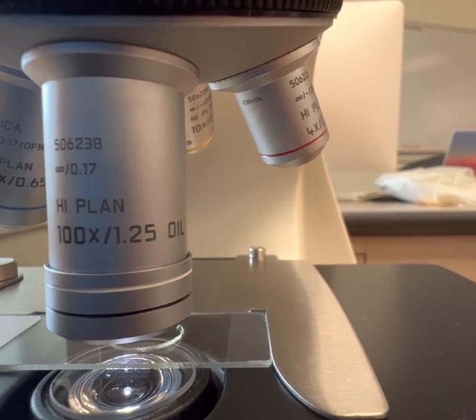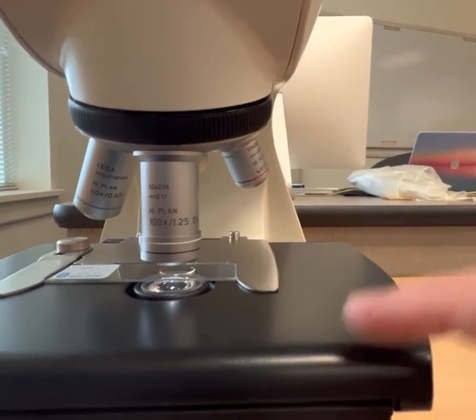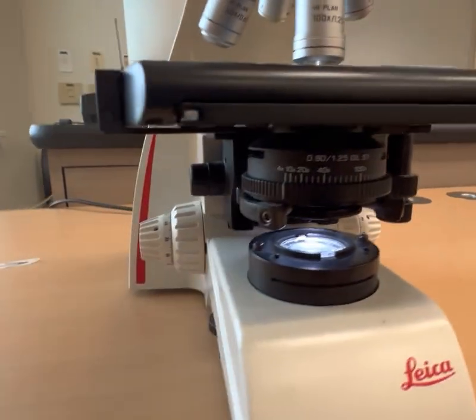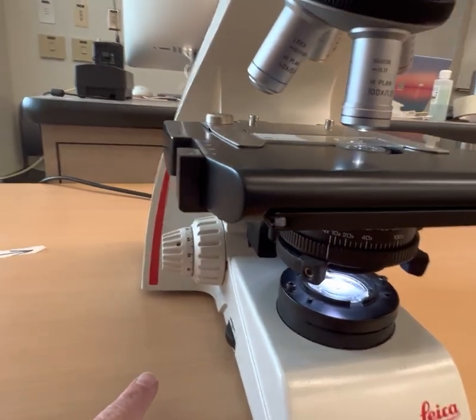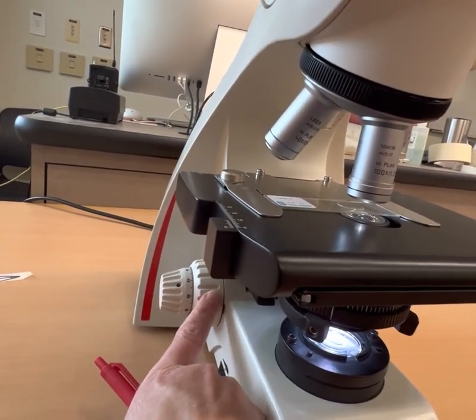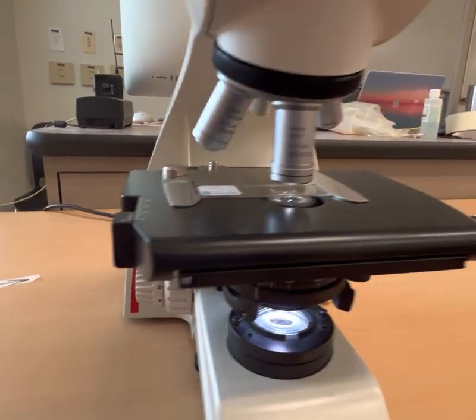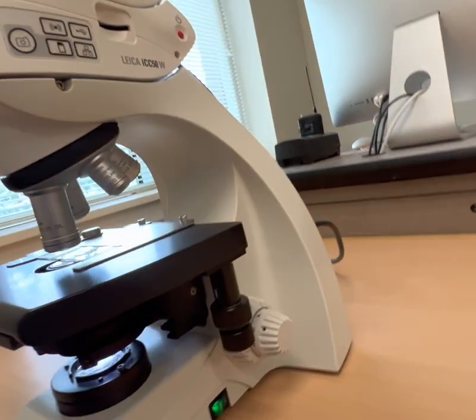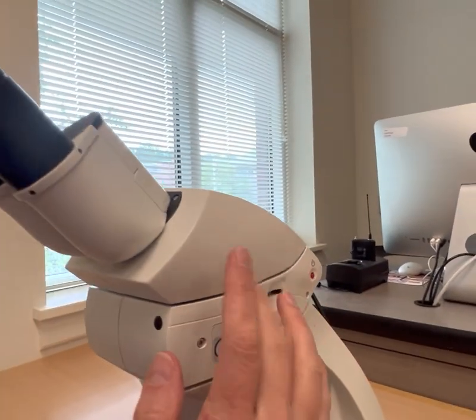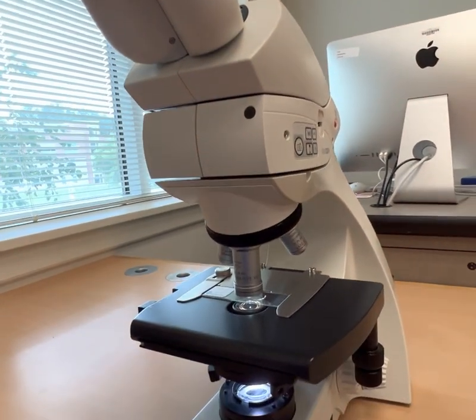So those are your 4 objectives held in place by the nose piece. I got my slide on my stage clips and my mechanical stage. Here was our iris diaphragm. There was our light source, the light bulb underneath. We said we can control it over there, make it brighter or darker. These are also focus knobs. Coarse one is always the big one. The coarse adjustment knob is always the big one. The fine focus knob, the fine adjustment knob is always the small one. And power switch, power source, our arm, the tube, and our 2 oculars up above. So those are our parts of our light microscope.